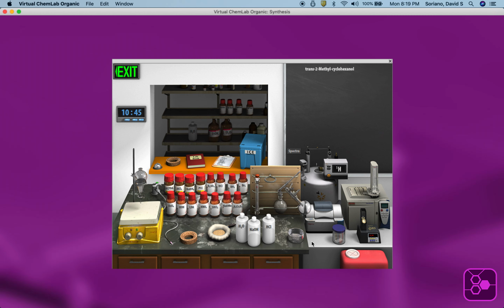We evaporated it in the hood, I hope. You wouldn't want that done on the benchtop. You'd be filling it with diethyl ether and filling your lungs with it. I had my tonsils out with diethyl ether in the 1950s. I'm 67 in June. It was fashionable then.